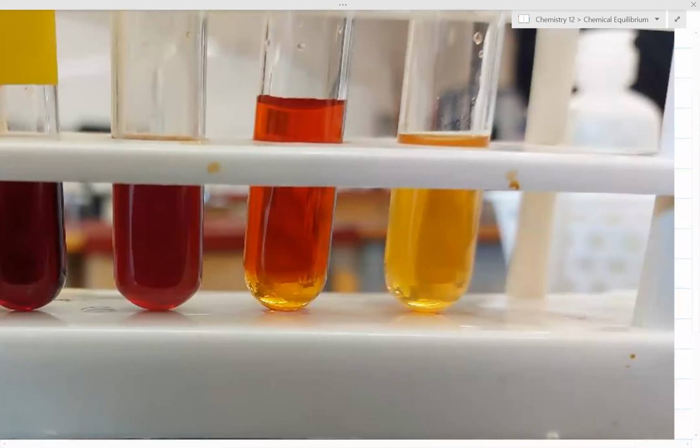Test tube E turned really yellow, but it was a cloudy yellow. Hopefully you folks noticed that. Some of you are like, I didn't notice anything. Okay, that's what I mean by yellow with crack. There's little stuff floating around.